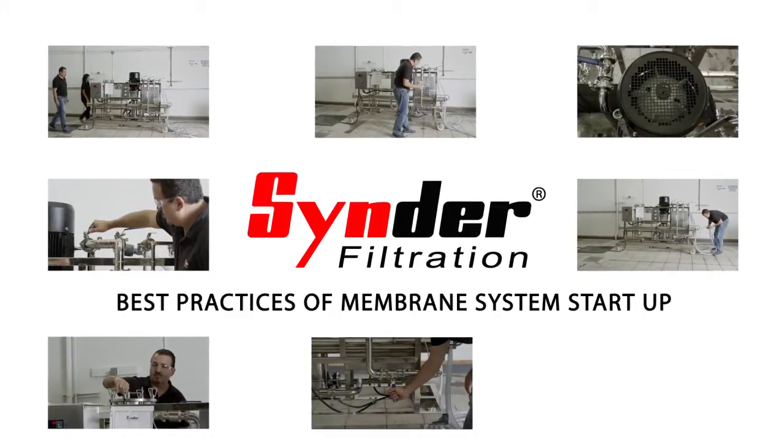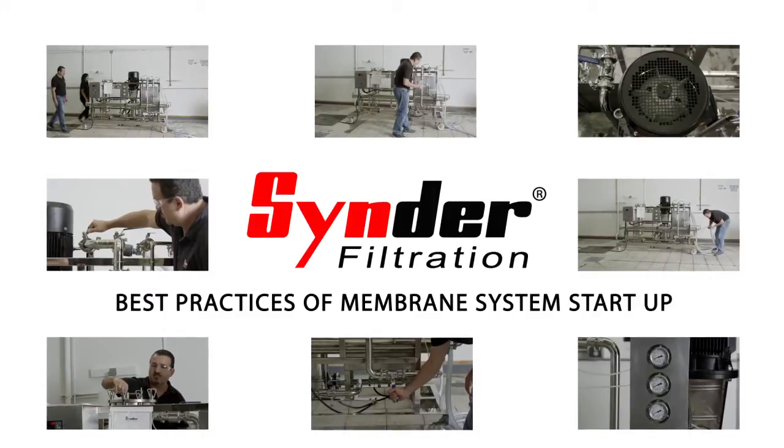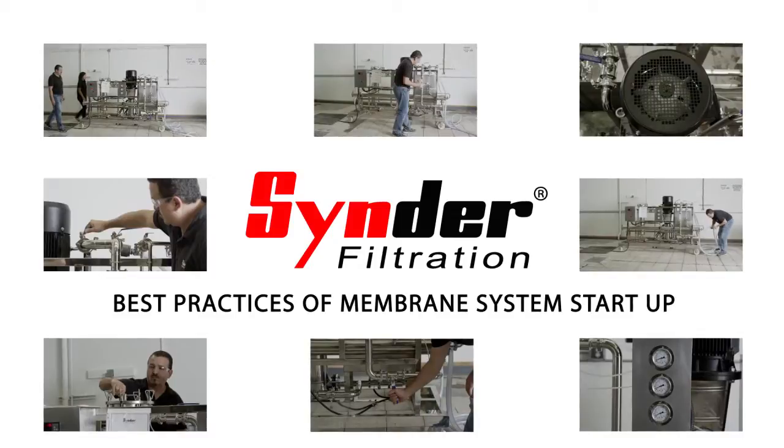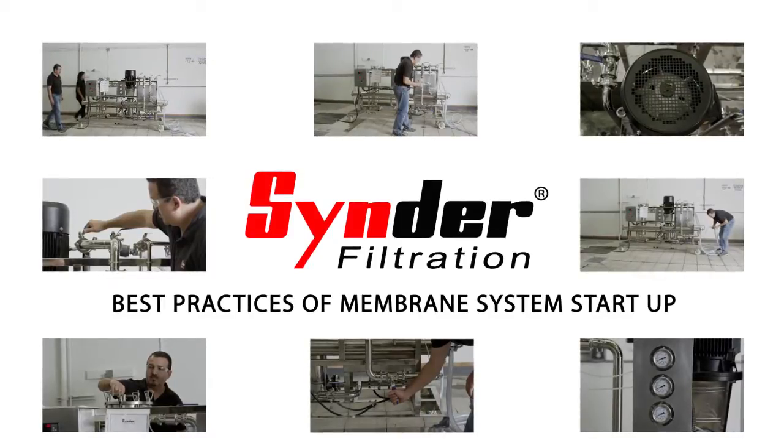For the purposes of this video, we will assume that the membrane system has already been installed and leak tested. We will also assume that the elements and pre-filters have been properly installed prior to the startup.